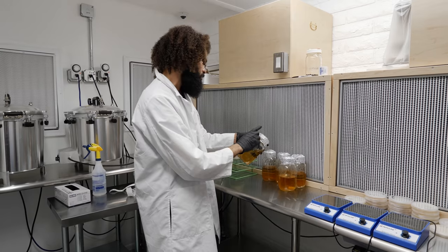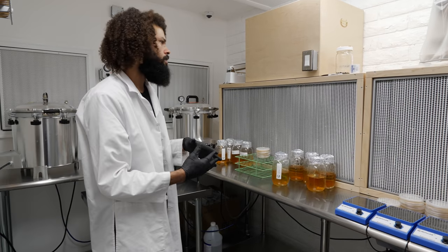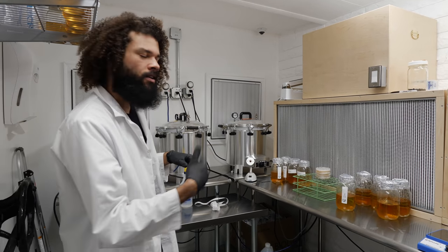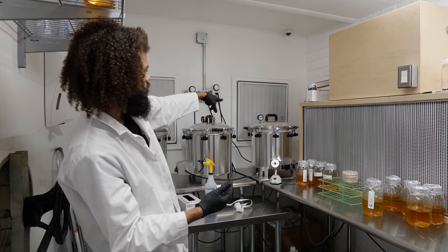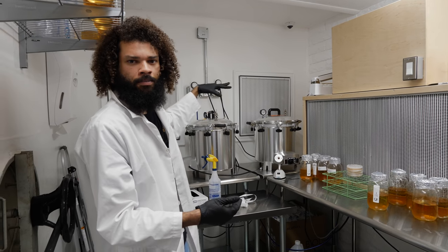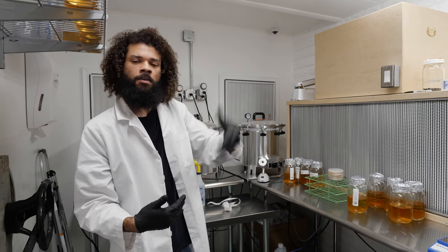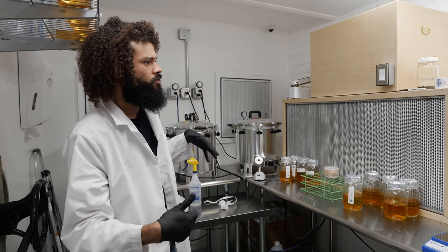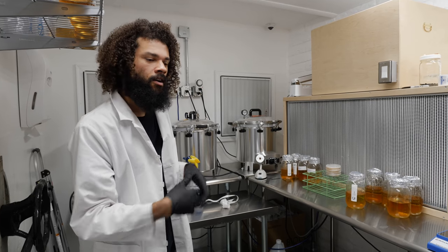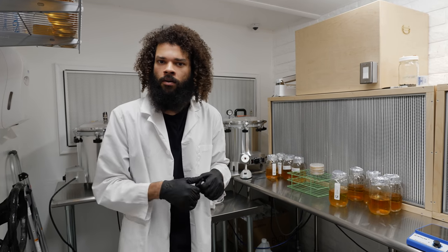This lab is pretty similar to my other lab — they're both positive pressure labs. One difference is the HEPA filters are recirculating already HEPA-filtered air. Air is brought in by two 2-foot by 2-foot HEPA filtration units with a pre-filter. It brings in air from the next room, passing through a UV light which kills any bacteria, then through HEPA filtration. Once in this room it's recirculated, so the air is super clean and it creates a positive pressure so any dust or contaminants are blown outward.